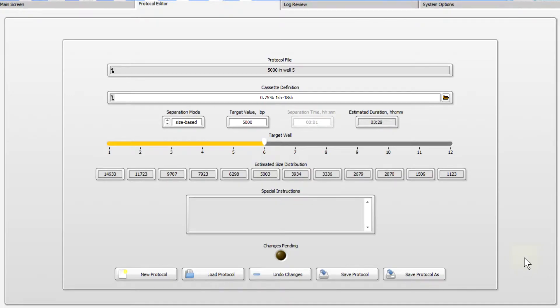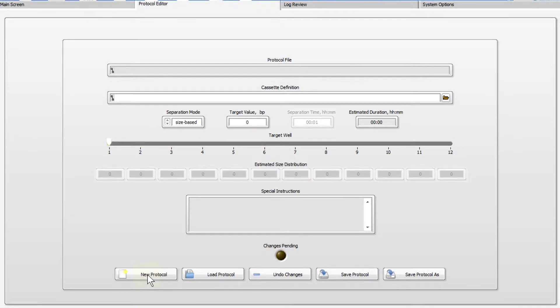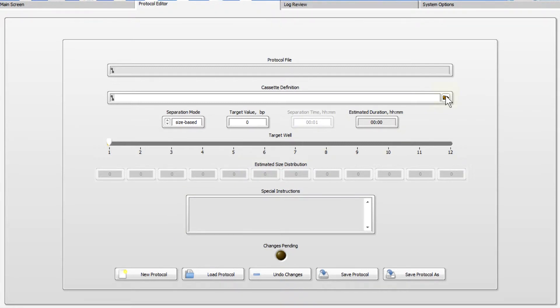In the software, go to the Protocol Editor tab. Press the New Protocol button to begin; this will clear all fields. Next, select the cassette definition from the drop-down menu. These have been validated for the range of sizes indicated.